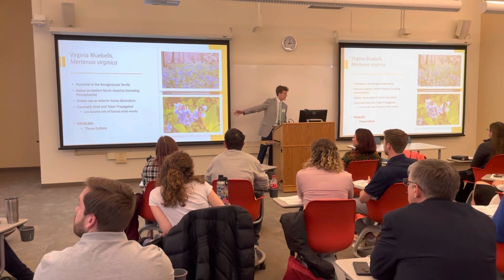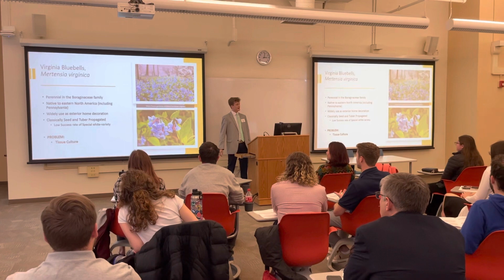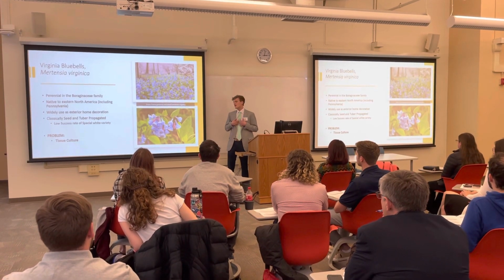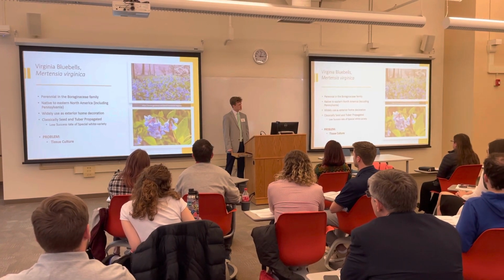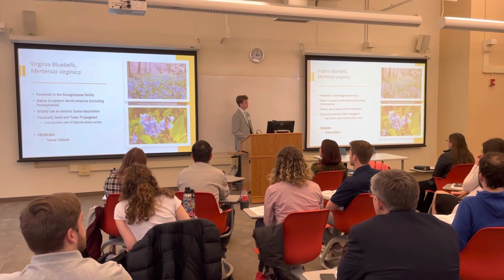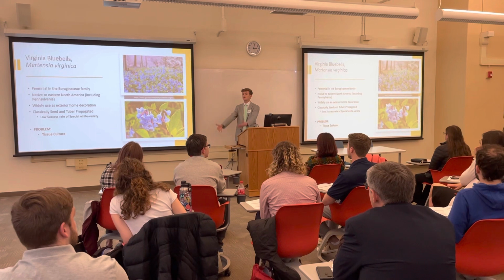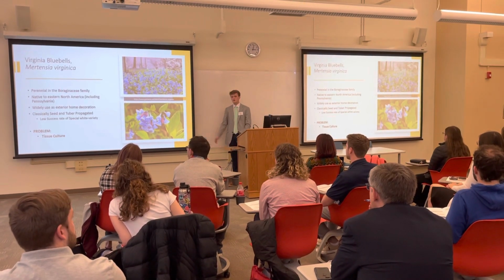Why aren't we okay with that? Because we're difficult. No, because there's a low success rate of a special white variety that we have on campus at Messiah University. Only about 80% of the time or less, usually much less, does seed propagation actually give us that variety. And so we want to make those numbers higher, and we want to make this a more industrial scale type thing. So our problem is tissue culture.